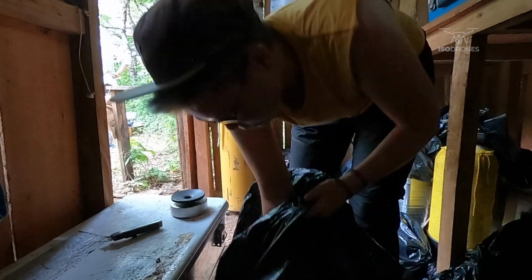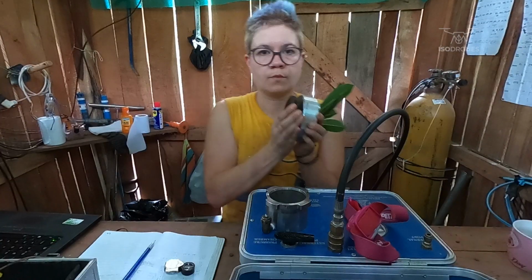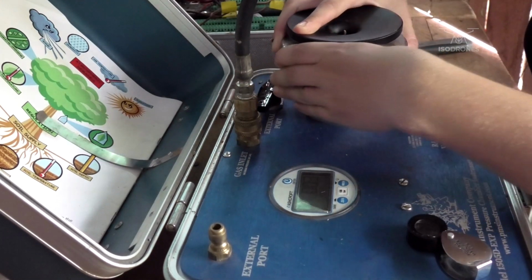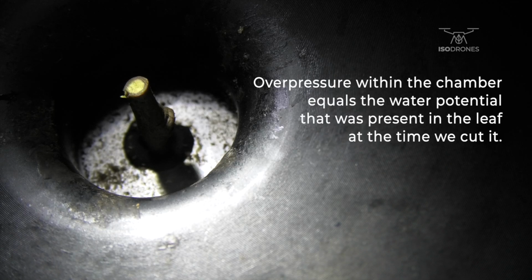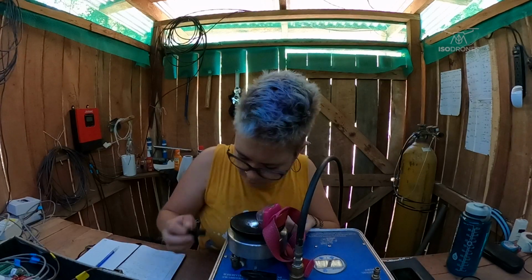And once we're ready to measure, we cut off a piece of branch and we place it inside this lid, and then we can place the leaves inside the pressure chamber so that we can still see the cut surface from here. And we close it tightly, and then we're ready to increase the pressure. And now we're increasing the pressure until water comes out from the cut surface, and this overpressure within the chamber then equals the water potential that was present in the branch or in the leaf at the time when we cut the branch. With this one, it's about 2.2 megapascal.